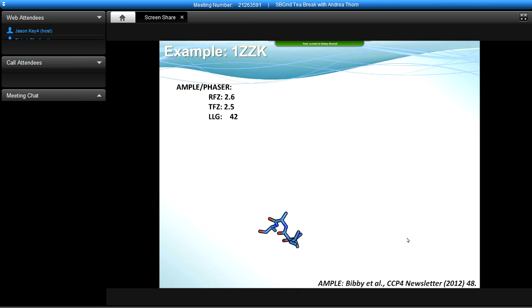So this is an example of pure molecular replacement with SHELXE. You have a molecular replacement solution which is from Phaser and has been generated by the pipeline AMPLE, which uses ab initio models, and the data have been given to me by Ronan Keegan, who has done this research. So it's a very nice example. I'm very grateful that he gave it to me.